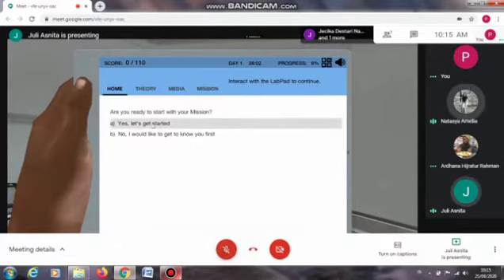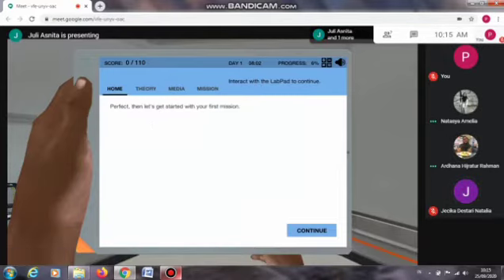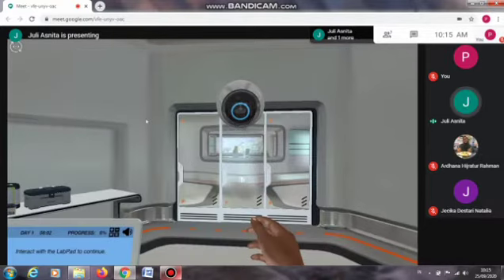Yes. Perfect. Then let's get started with your first mission. Continue. Mari kita mulakan. Ayo cari perlengkapan sebelum masuk.